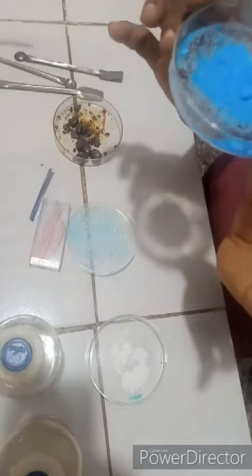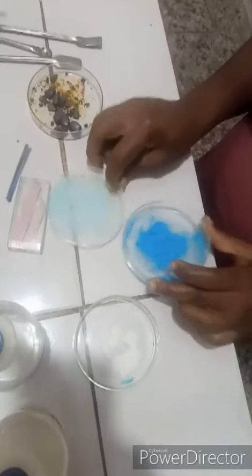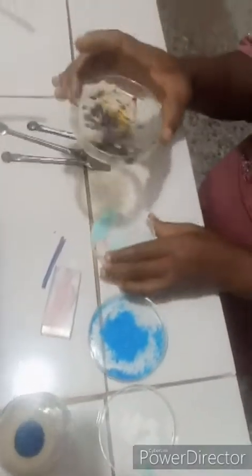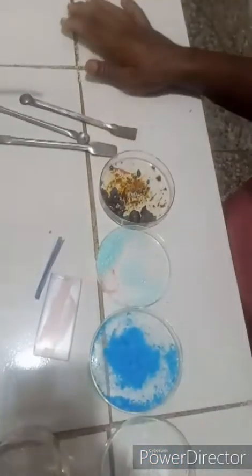So when you look at this particular salt as a student, you can assume that the cation here is copper 2 ion, although you've not done the confirmatory test. The third salt in my hand is a green salt. The likely cation you can infer in this salt is iron 2 plus. Another salt I have in my hand is a reddish brown salt. Most iron 3 salts are reddish brown in color. This is what we call the preliminary test.